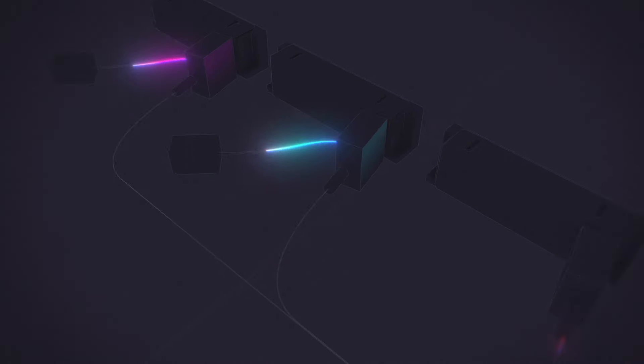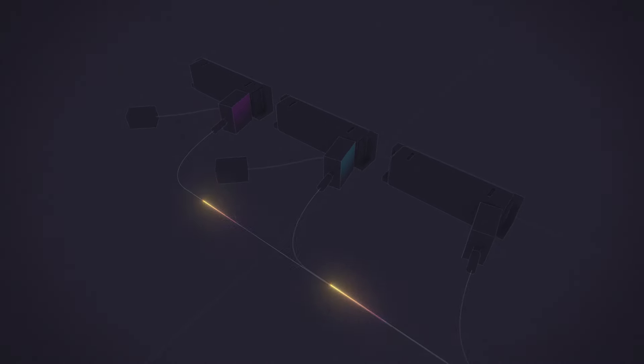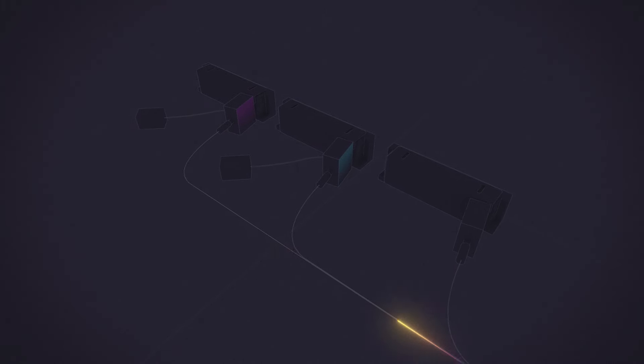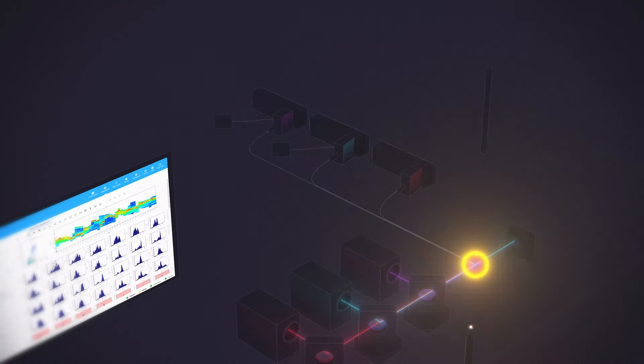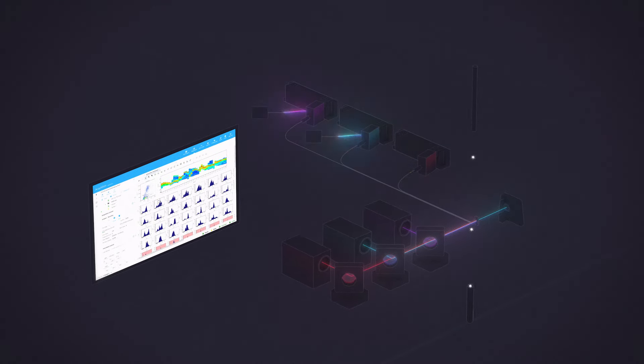That light is captured using coarse-wavelength division multiplexing, converted to an electric signal by the avalanche photodiodes, or APDs, and then processed and displayed in the software.